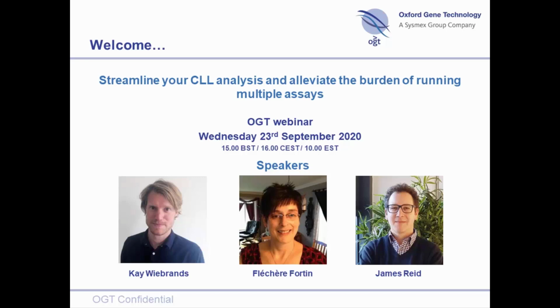And then you mentioned variant annotation. So downstream, as I demoed, you are capable of downloading a lot of the results files. And of course, an important one there from the variant point of view is the so-called VCF file, which contains the variant calling results. And that could be used as input to an external third-party tool for doing variant annotation. So very much yes on that front.